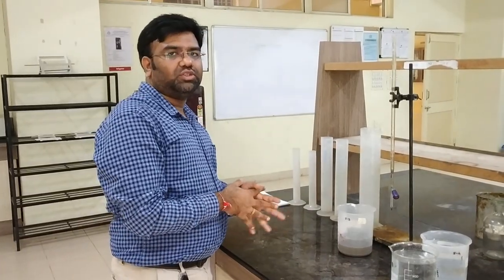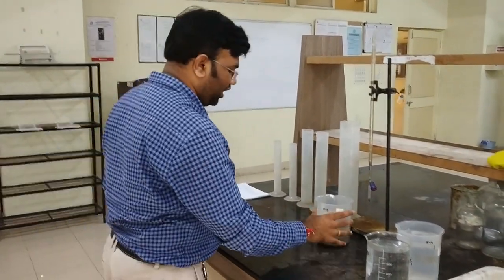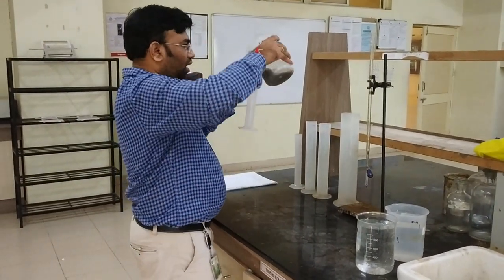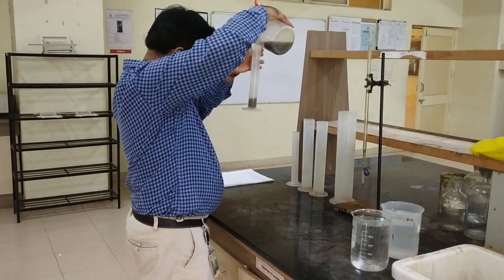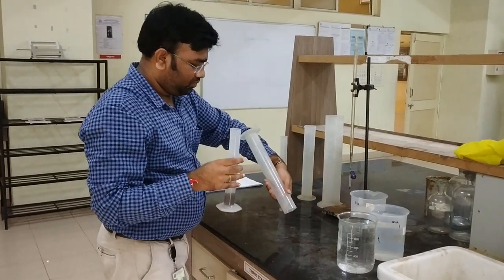Double dilution done, now we are going to see the triple dilution, right? So we are going to achieve a dilution factor of 2000. According to the table, the first step is to take 25 ml of sample and dilute it to 250 ml. So I am going to measure the 25 ml sample, and I am going to dilute it to 250 ml.